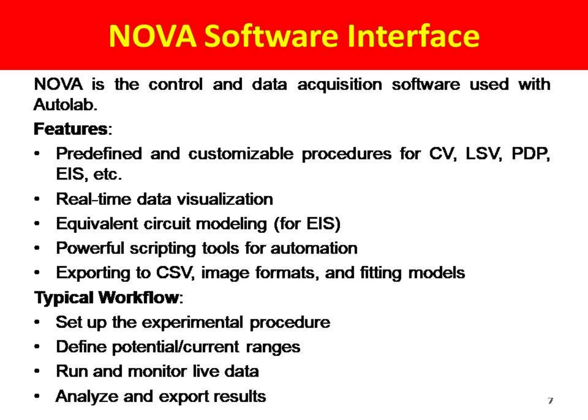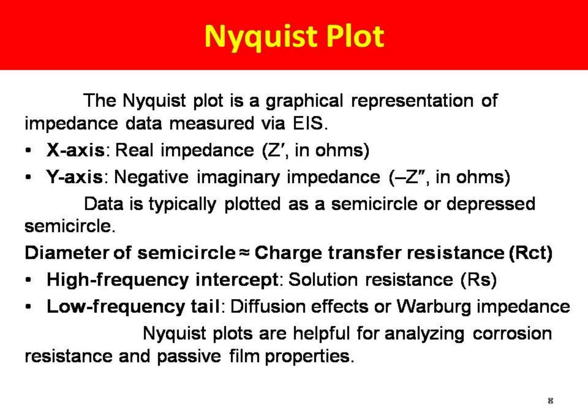Typical workflow: you set up the experimental procedure, define potential or current ranges, run and monitor live data, and analyze and export results. Coming to the impedance spectroscopic studies, the important plot obtained is the Nyquist plot.